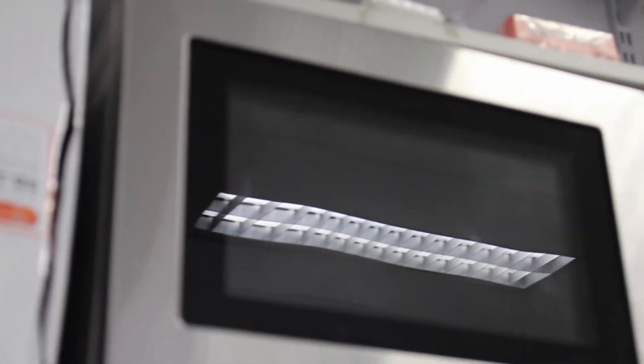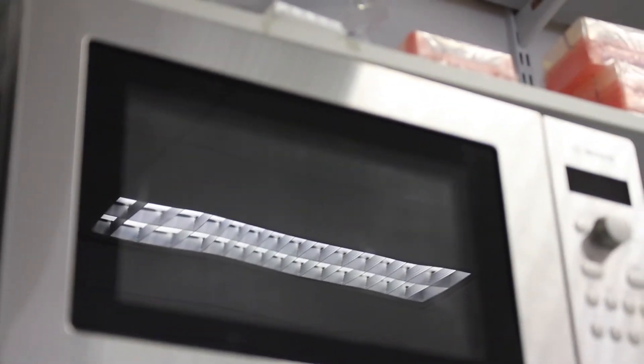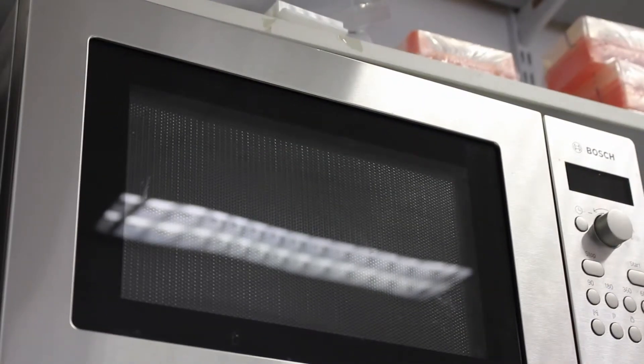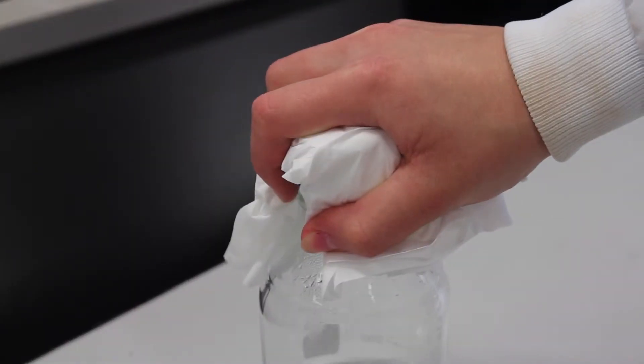The mixture is microwaved for a few minutes. It is important not to boil the solution out of the flask. The flask at this stage is extremely hot. A folded piece of paper is used in order to handle the flask as shown.